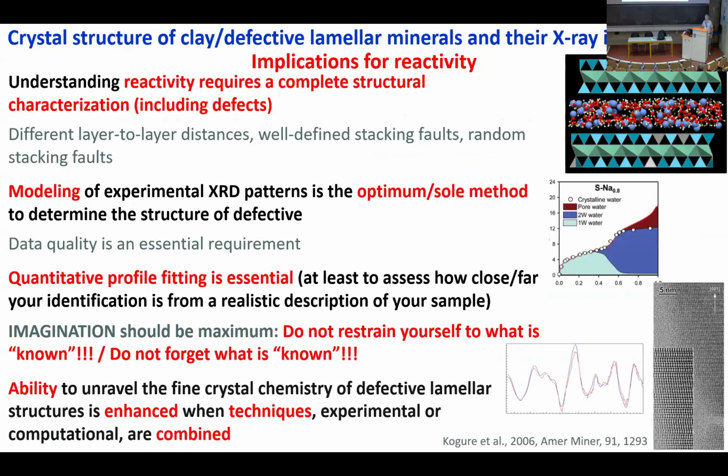And probably, yeah, last thing is, again, to emphasize the importance of independent constraints. Independent constraints could come from high resolution TEM, from X-ray absorption spectroscopy, from water absorption isotherm, from molecular simulation, or from any other technique, experimental or computational. Everything else you can have would help to constrain the data you have and your interpretation. And with that, I will take any questions.